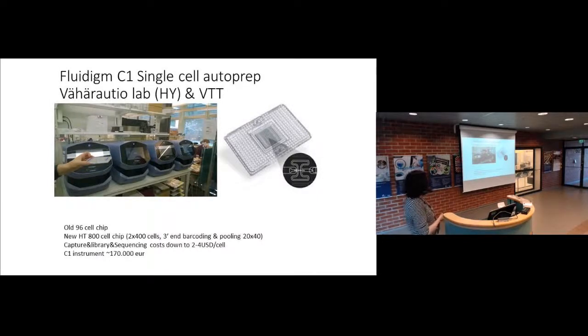The instrument, I don't know the current price, but some time ago it was 170,000 euro, and now they have also the high throughput chip for 800 cells, so that they can do 20 times 40 pooling here, and it's about a few euros per cell doing those analyses.